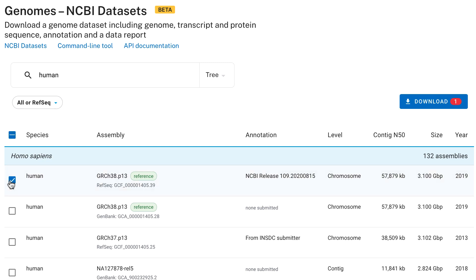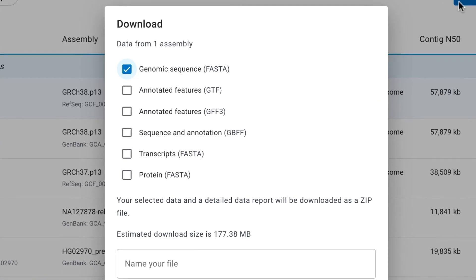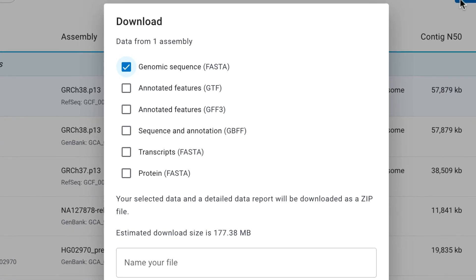To download the data, select the assemblies you want and click Download. The dialog box allows you to select genome, protein, and transcript FASTA sequence, and offers a choice of annotation types, including GTF, GFF3, and GBFF, the GenBank flat file format.